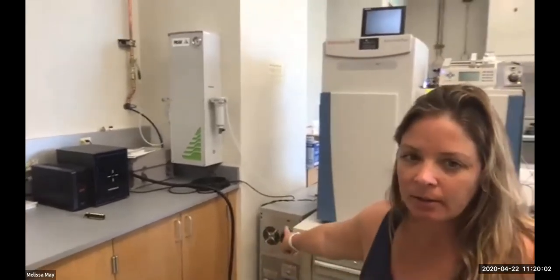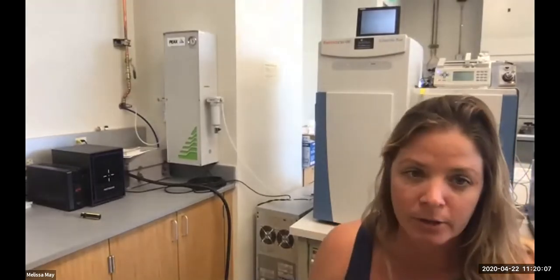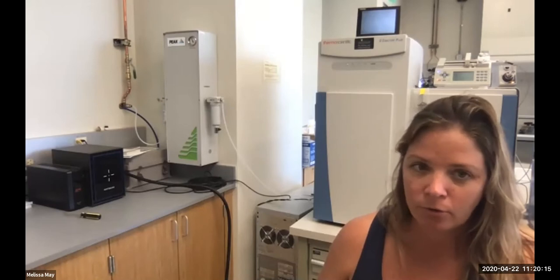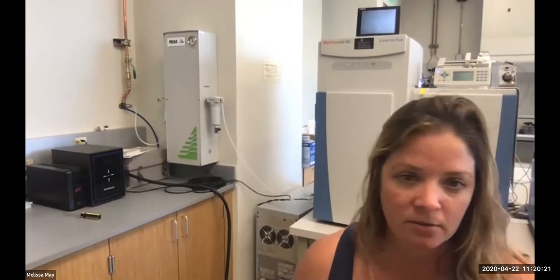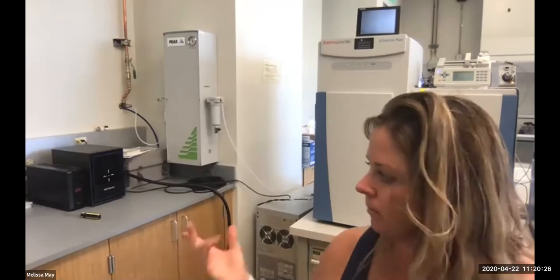Down here, you can see that there's this large power pack. This is our backup battery source. If there are temporary fluctuations in the power, this will keep the instrument on for a few minutes. But I've been told that it can't keep it for really extended periods of time. So this kind of just helps. It's like a surge protector battery pack.